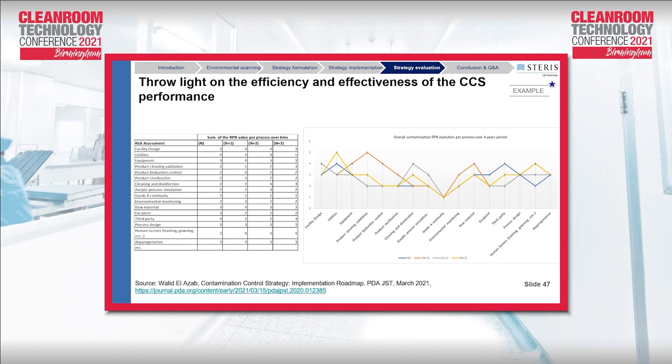So if the residual risk is evolving into a higher residual risk, that means there is a need to assess if this is going through the threshold where your strategy, the vision of your strategy, says, for example, if I have a residual risk above 3, then I need to take action. If I am below, that means it is acceptable.